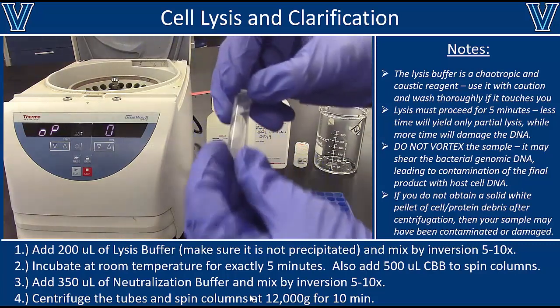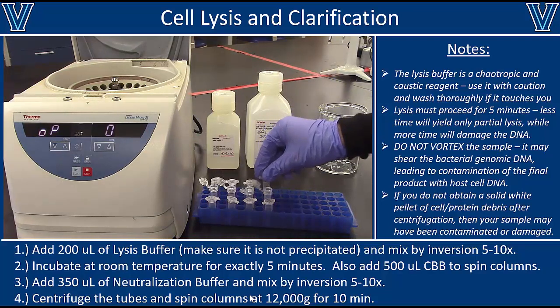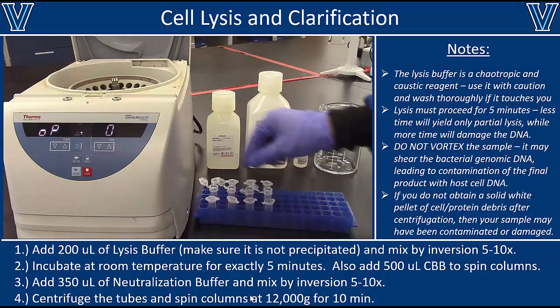Now, it's okay if you see something like these last two tubes where there's some pellet on the wall, but by all means, you should have a clear supernatant. As long as you have a clear supernatant, you can proceed on to the next step. If you have something that looks cloudier, or if that pellet's not quite as tight as what you're seeing here, or as compact, rather, then it might not be worthwhile to continue this mini prep. You might want to repeat the overnight culture to see if you can do it again without getting it contaminated.